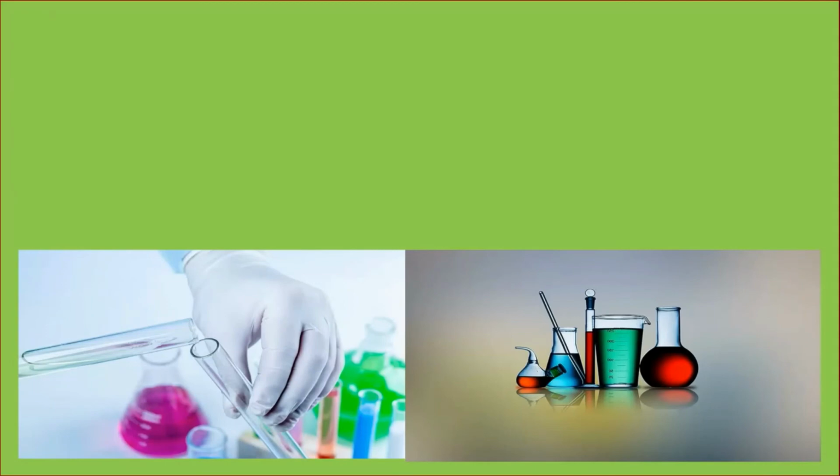So in today's lecture we have studied two ionization techniques, APCI and APPI. In the next lecture we will discuss some basic terms involved in mass spectrometry and also fragmentation.